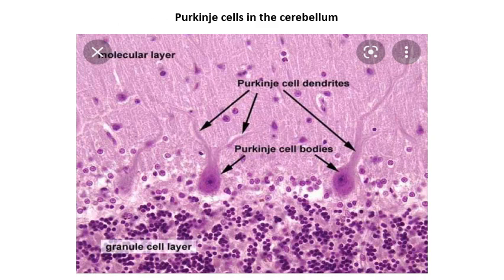Here are the Purkinje cells that are present in the cerebellum. Here you can see the molecular layer, the Purkinje cell layer, and the granular layer. The Purkinje cells appear pyriform and contain processes, and they are present in one layer.